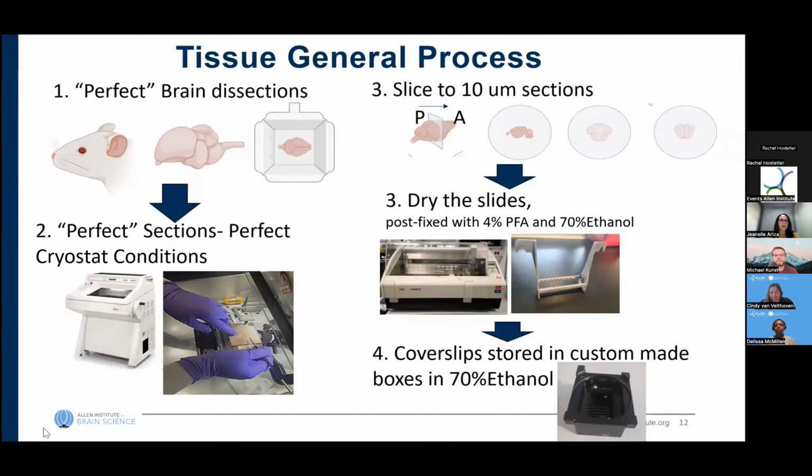As you may know, the brains that we use for this brain atlas are not perfused, are not cleaned with PBS or anything like that. So it requires that high precision dissection with a very mushy brain without fixation. So that requires that the brain is taken out of the skull very carefully to avoid any damage on the structures or the main structures of the brain. And we only process for these specific analyses brains that have no damage whatsoever.